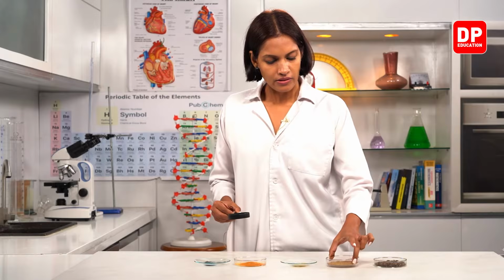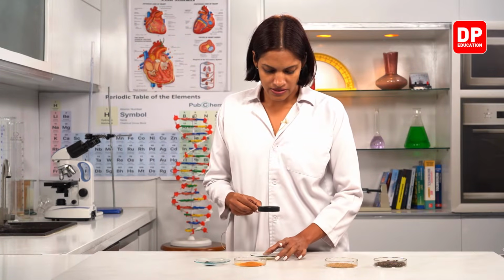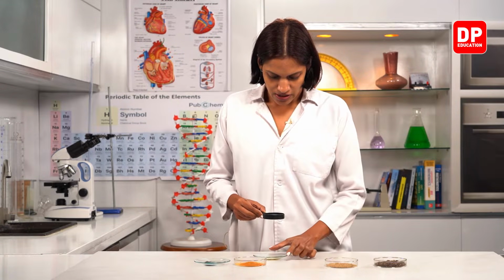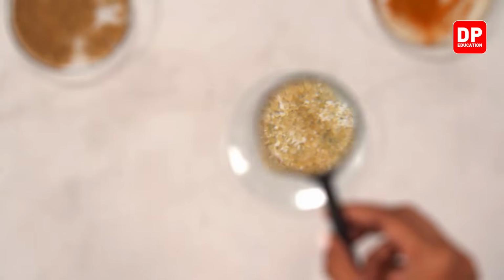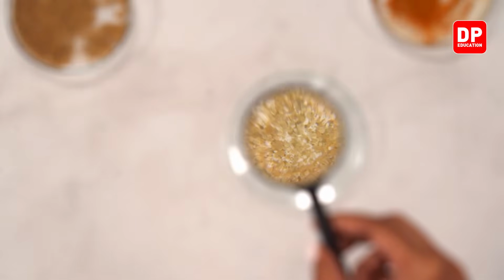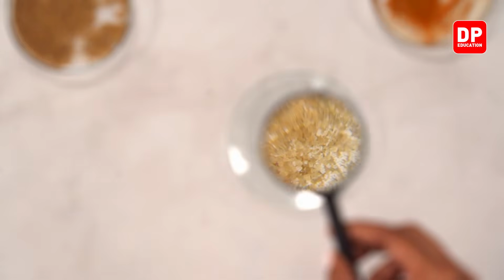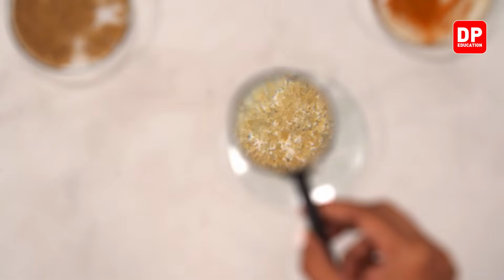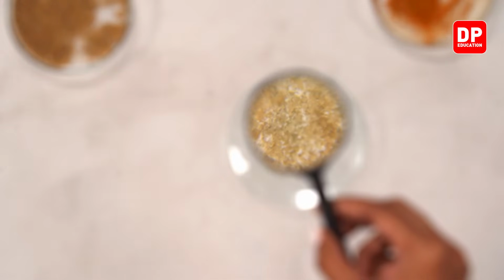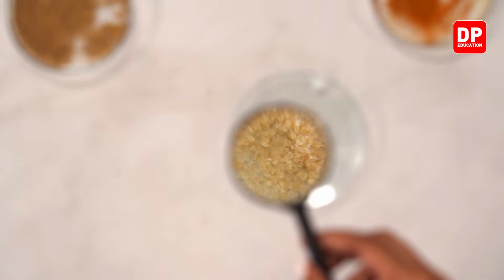Here I have a mixture of sugar. Here we'll see brown sugar and white sugar are mixed with each other. So you all can see very clearly bigger crystals of brown sugar than that of the white sugar, right, children? Yeah, brown sugar crystals are bigger than the white sugar crystals.